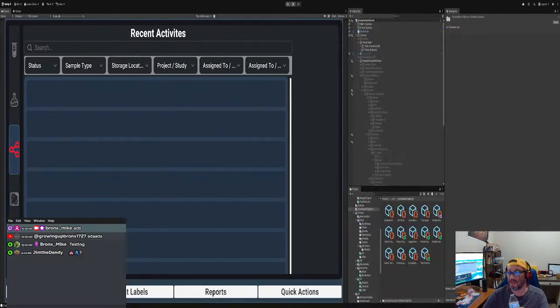That's for another scene, and that has to tie to some abstract layer connecting to the machines that actually run the test, right? We are not writing code for tests. That's for somebody else. All right, to do. Okay, make sense? Copacetic? Good. All right, so I downloaded all that.